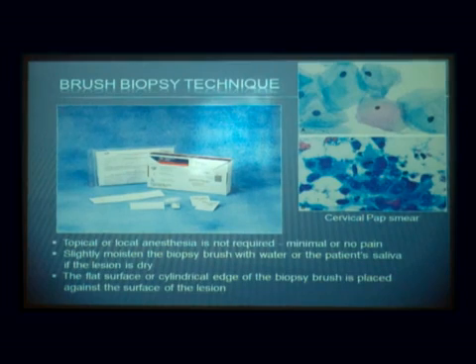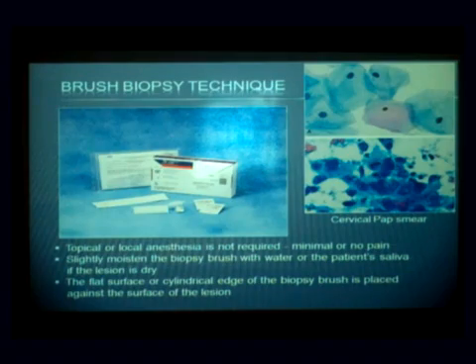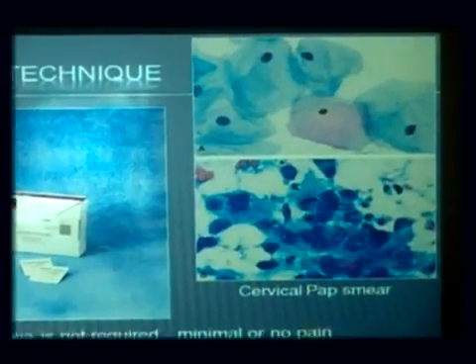So cytology isn't so great, but we have a technique that tried to overcome the cytology. It was very popular in the 90s and even the first half of the last decade. This was taking cytology, again, a very logical way of changing something to make it useful. This is a pap smear. This is what a pap smear would look like. These happen to be GYN cells, but this is a good one, and this is a bad one. You see how much larger the nuclei are, and you see how abnormal they are.